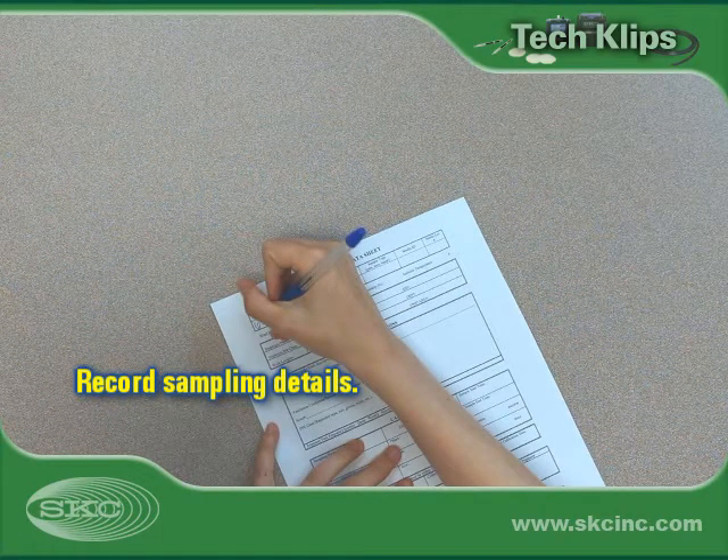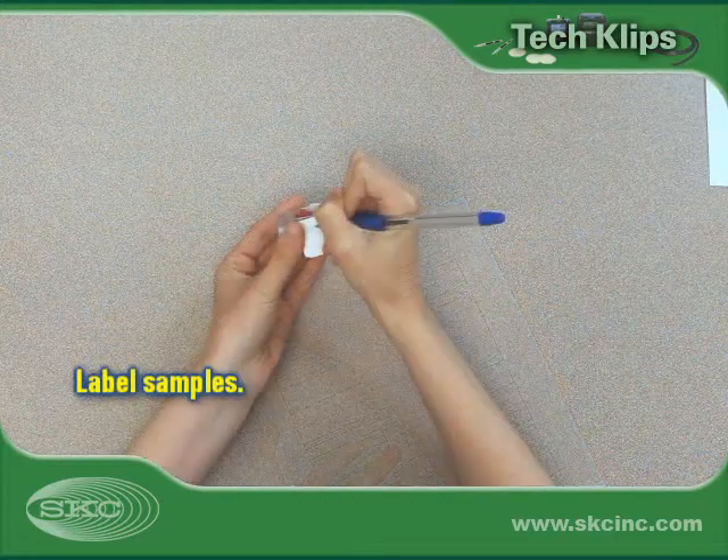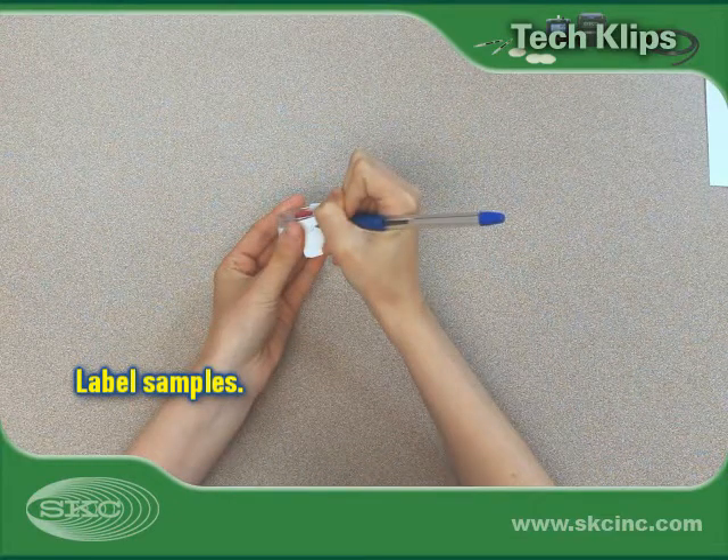On a sampling sheet, record pertinent sampling information such as sample start and stop time, flow rate, temperature, and atmospheric pressure. Identify and label each cassette for chain of custody.